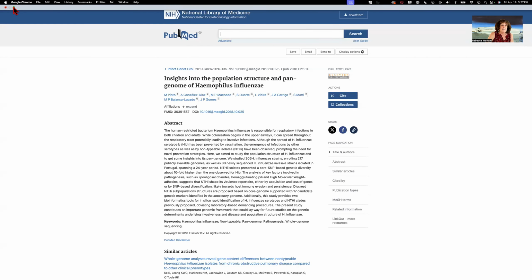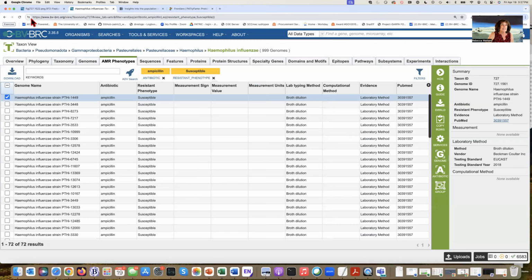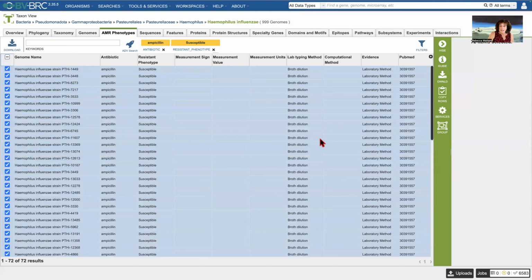And now I have to, of course, do this. So I can pop back here. Then I'll do this again because the picture's prettier when you see it all. And I'm all about providing you guys with the prettiest pictures. So I'm going to click on this, select all of them.